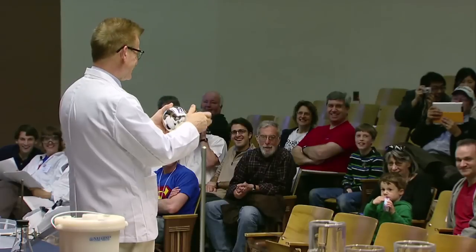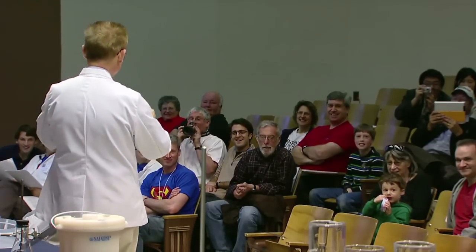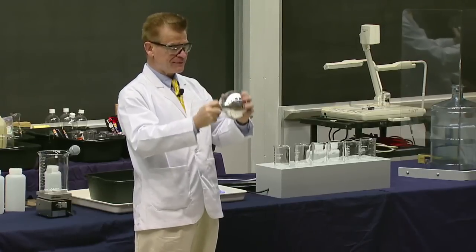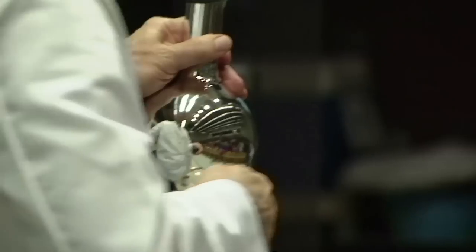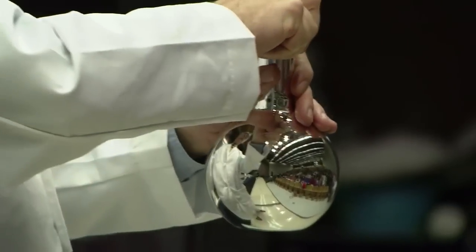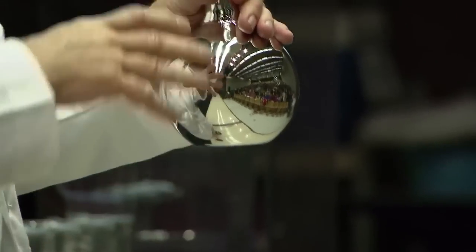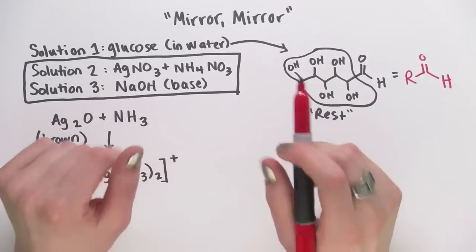Well, this is a real workout. I'll tell you. So what we've created here is a beautiful silver mirrored flask. So look at that.